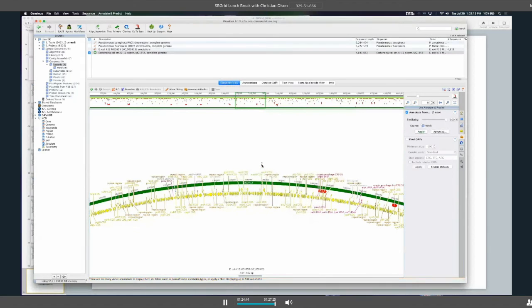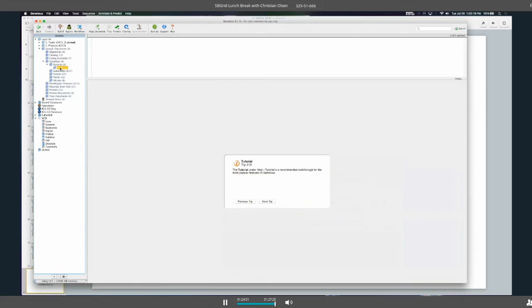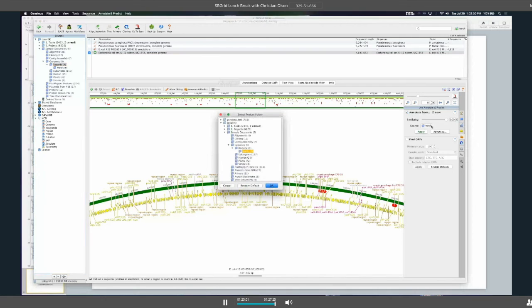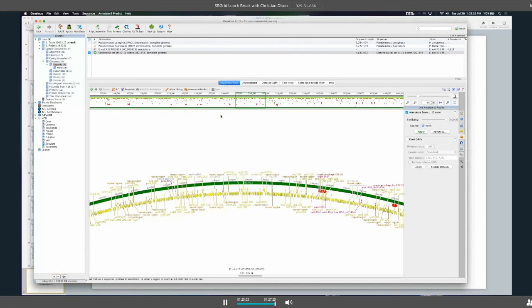motif that is found. This is actually a really nice way to do it because it uses pairwise identity, so it'll offer you a little bit of flexibility with those motifs. You could have 10,000 motifs in here and point to it from your sequence of interest. Over here to the right, the annotate from, I'm just pointing to that motifs folder that I have shown here. That is a way you can also search for motifs. So that might be helpful too.